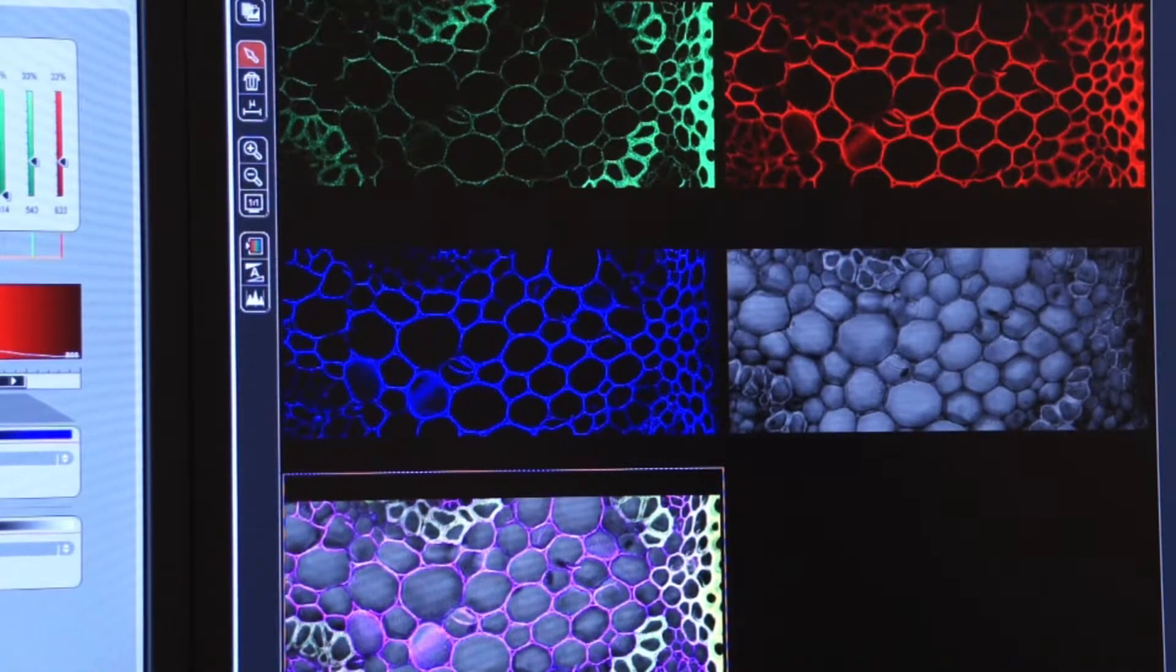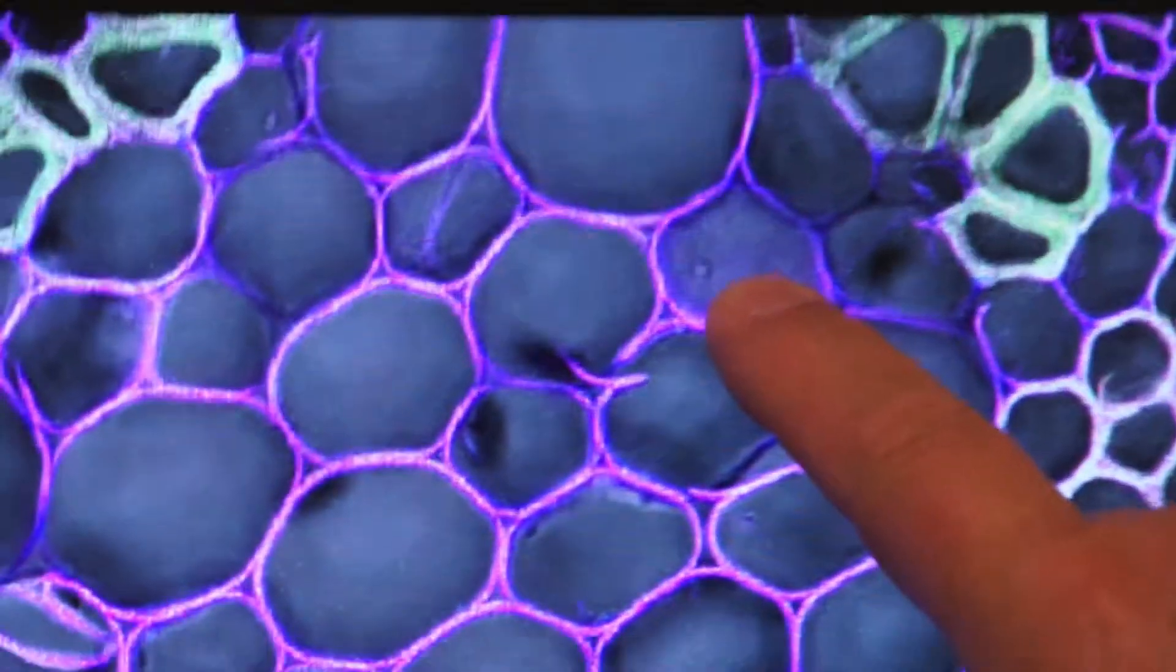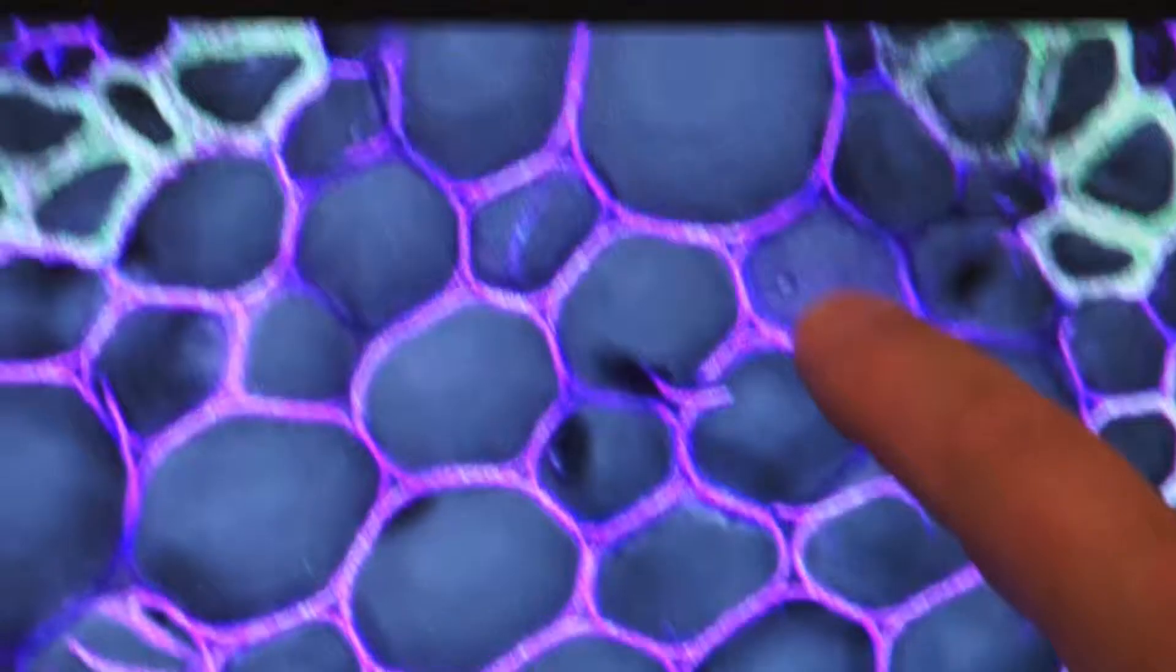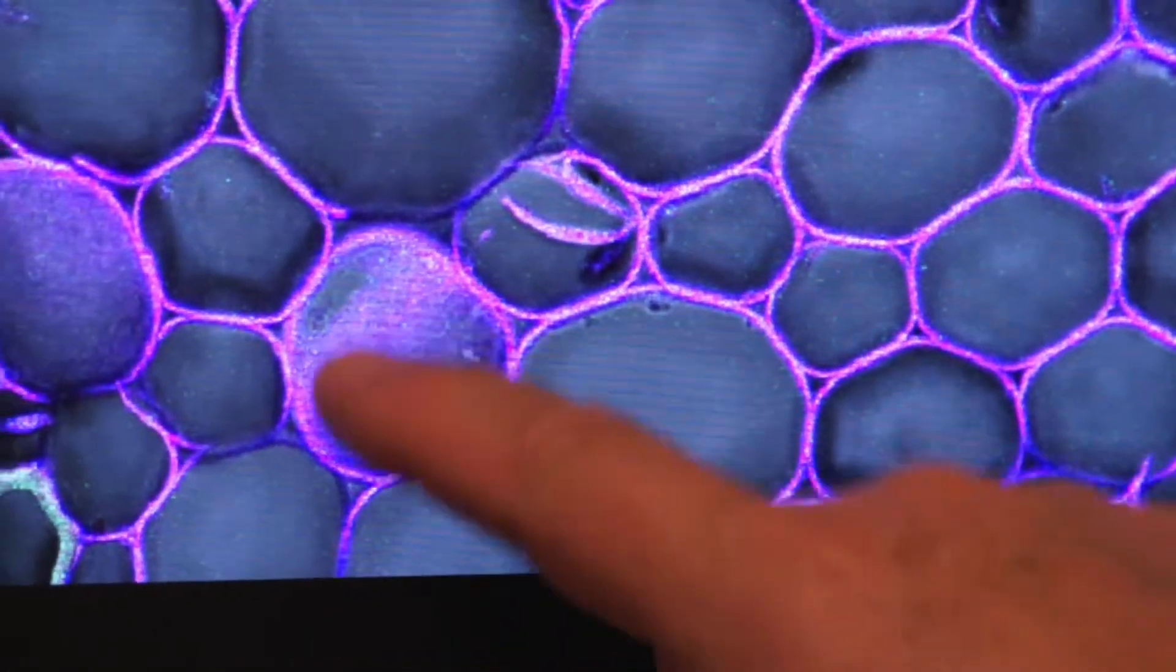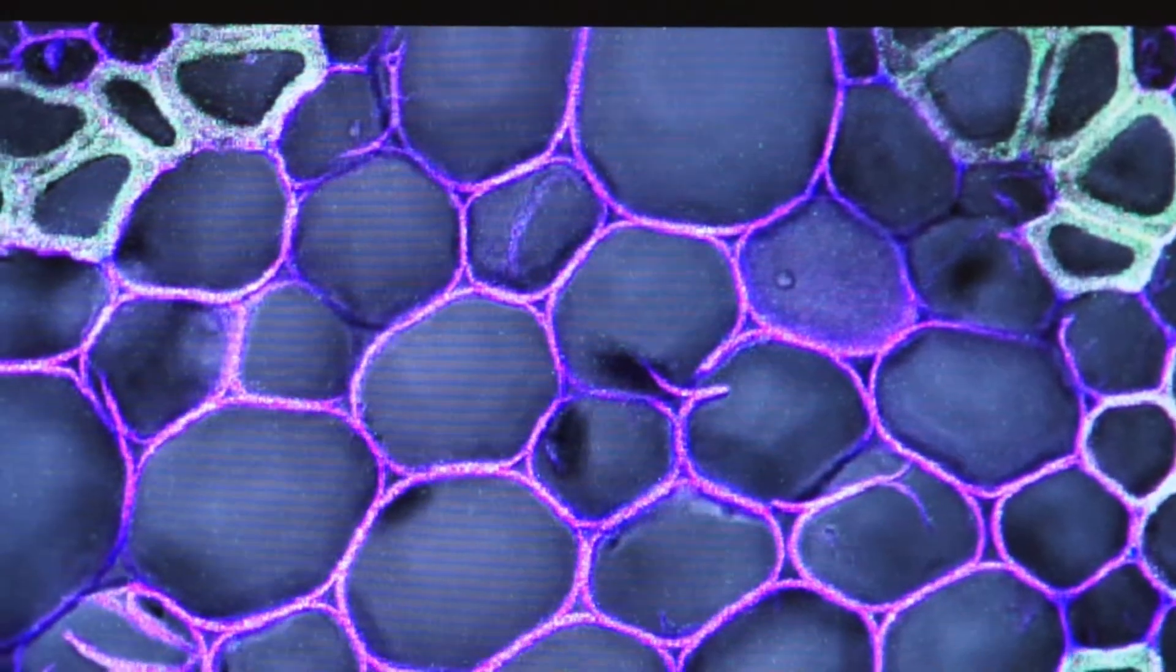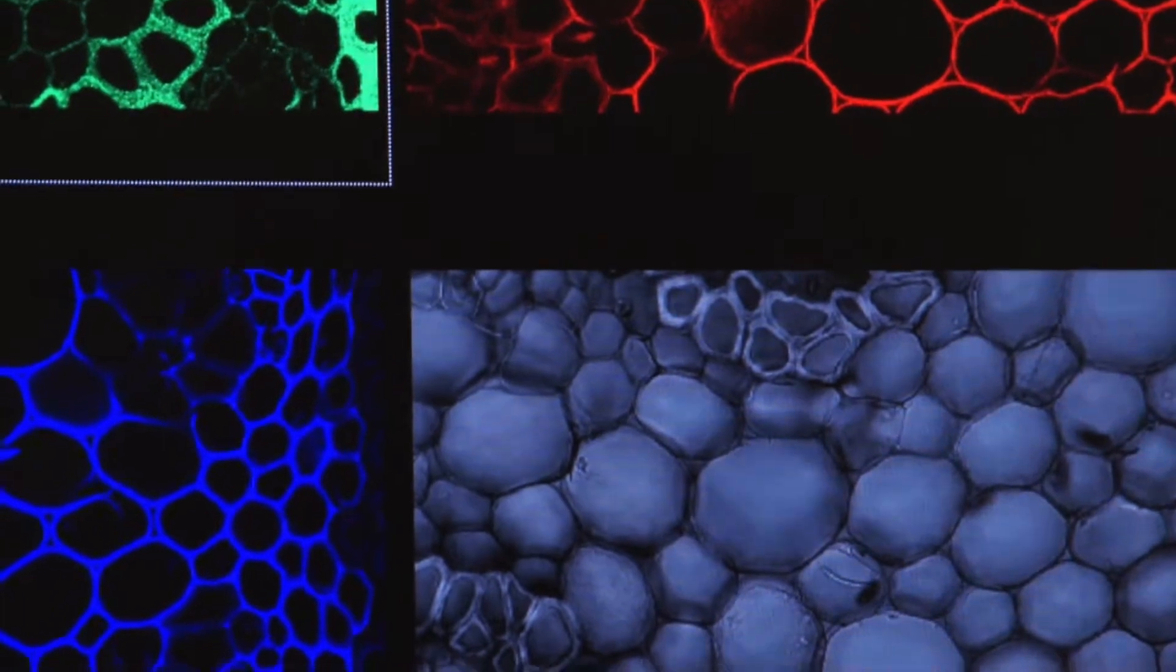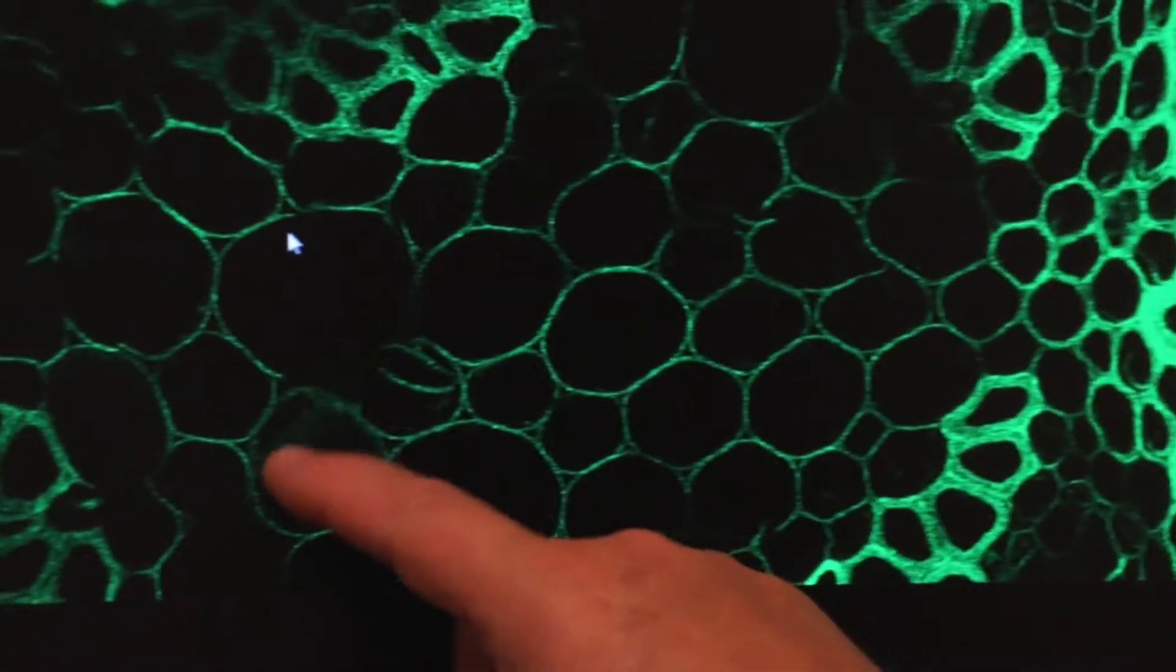Now why is this important? Sometimes there are structures that can only be seen in transmitted light. For example, that nucleus there, there's a nucleus down here inside of this cell. There's also other cellular material in here that you can see that is not illuminated by any of the fluorophores. For example, if you look at the FITC, you see no nucleus here. You see some of this intracellular material here, but you don't see that nucleus, which is a region of interest.